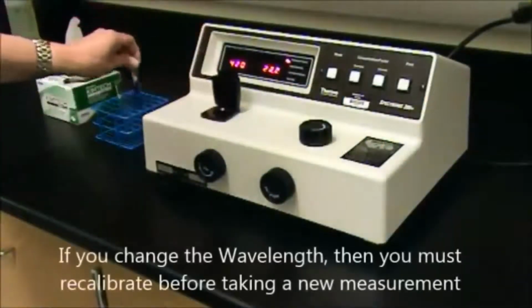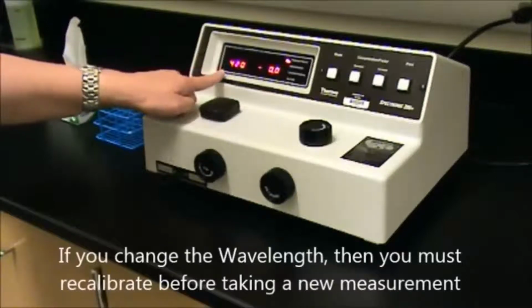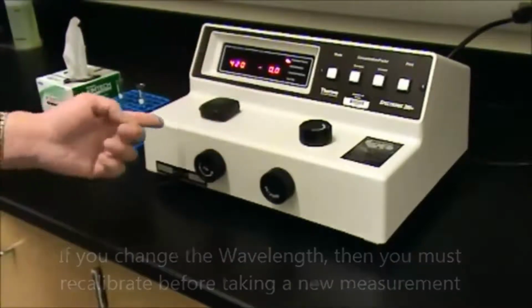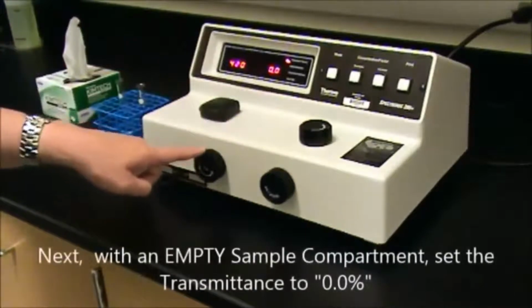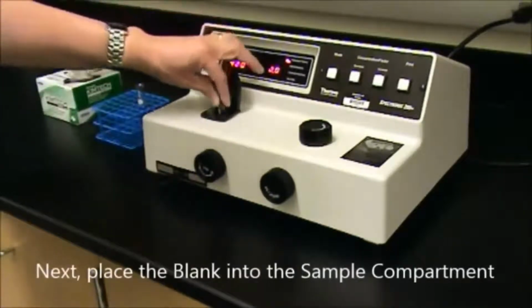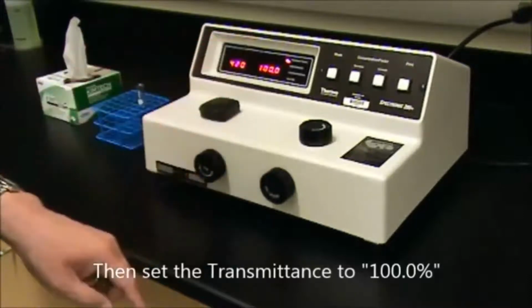But once you decide that you want to record at a different wavelength, let's say we want to switch from 420 to 480 nanometers, now we have to go through the entire calibration method one more time. So we'll have to begin by first changing the wavelength to the desired 480. We'll have to zero the machine using the zero control knob on the left. Then we'll have to put the blank cuvette back in. And then we'll have to use the knob on the right, the absorbance transmittance control, in order to set the machine back at 100% transmittance.